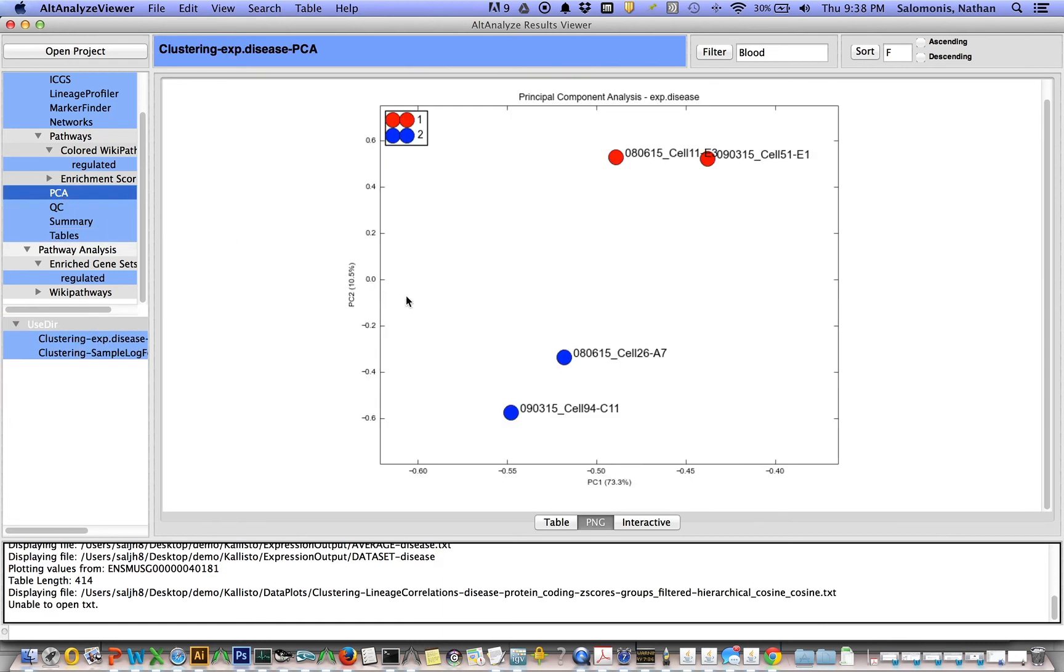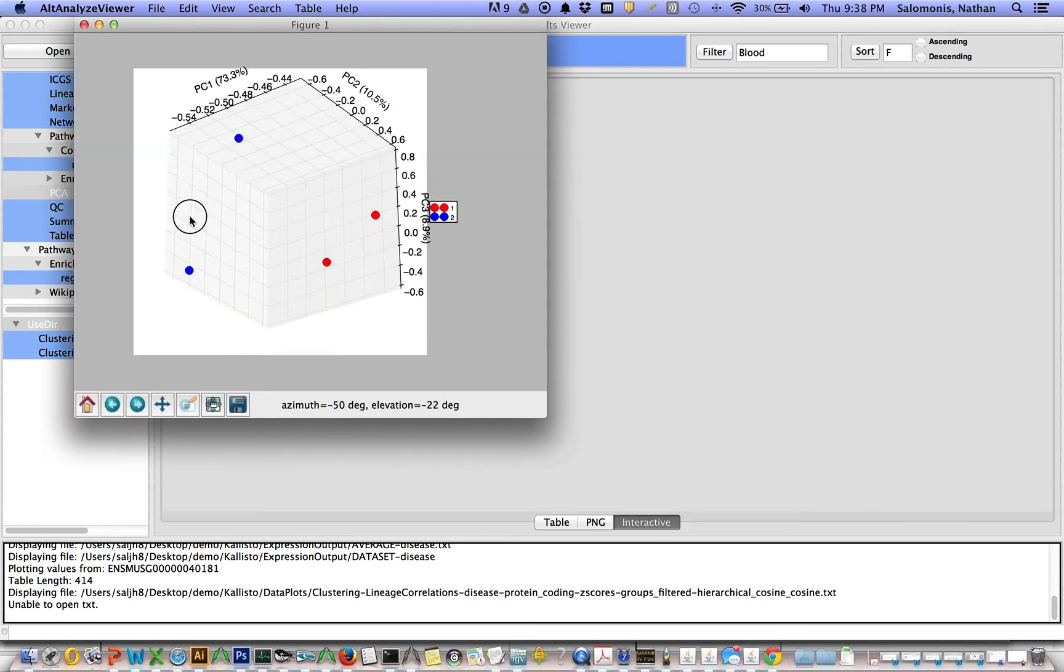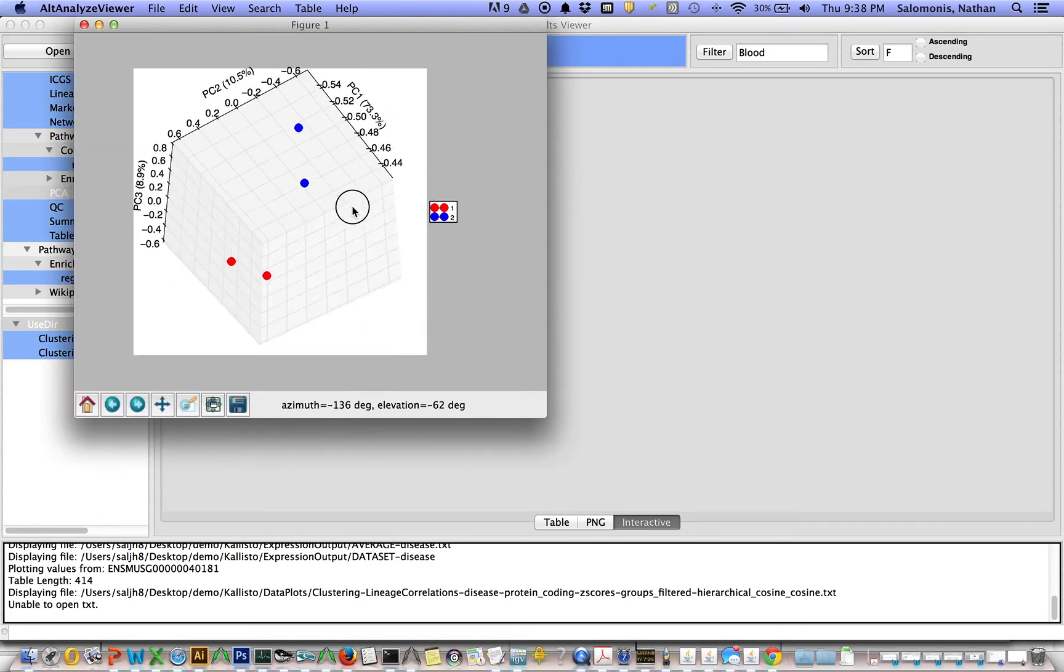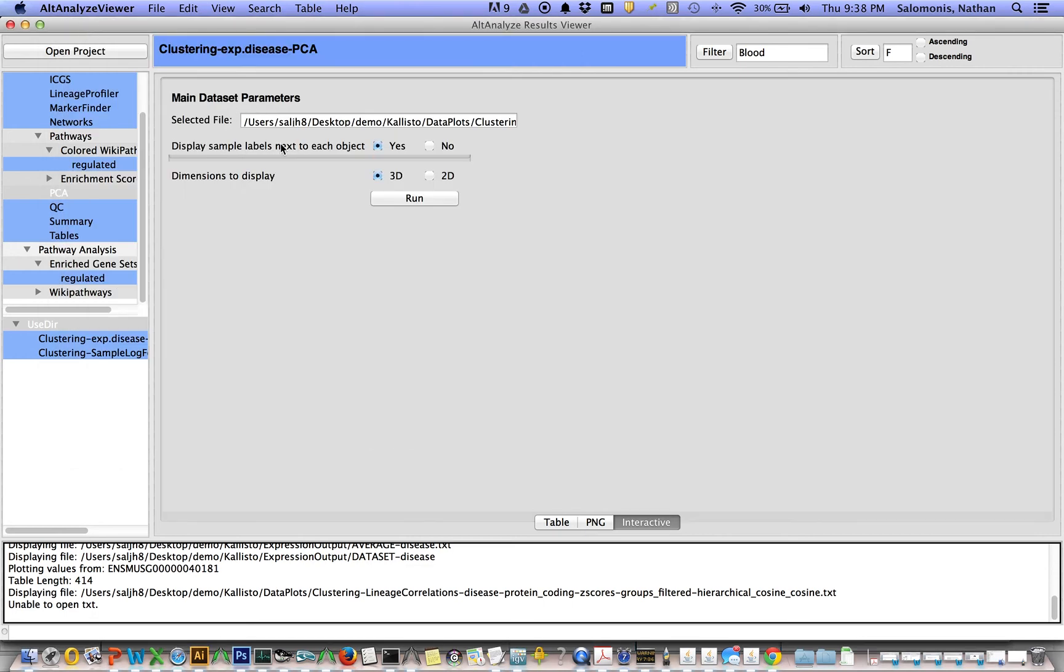You have PCA, not just PCA, but interactive PCA if you want it. You can view to include labels or not include labels, 2D or 3D.